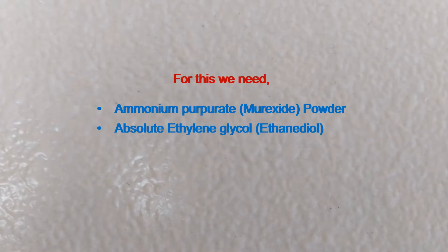This video contains preparation of 0.15% murexide indicator solution. For this we need ammonium purpurate, i.e. murexide powder, and absolute ethylene glycol, i.e. ethane diol.